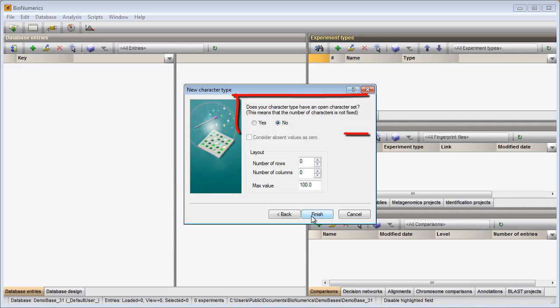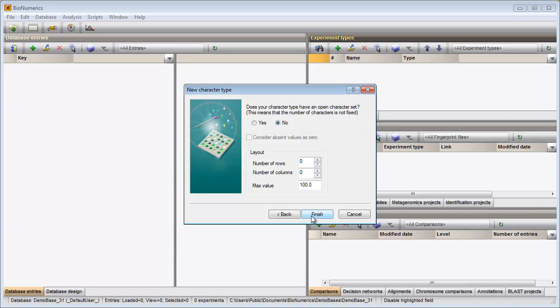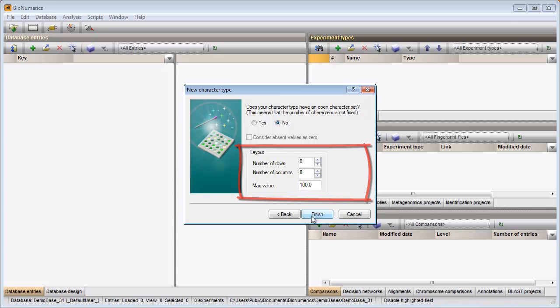Since the number of characters is fixed for all samples, I have a closed dataset and I can keep the selection. The layout of my card can still be changed after creation of the experiment so I can press Finish.